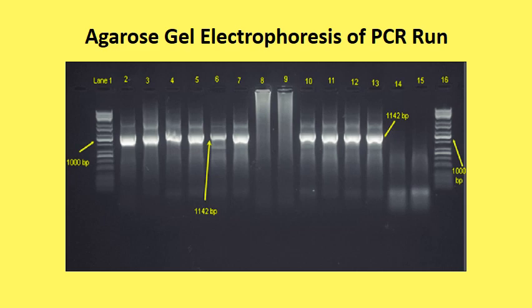This marker is expressed in base pairs, to compare with the final products of PCR for a specific sequence, which can also be determined by its molecular weight in base pairs.